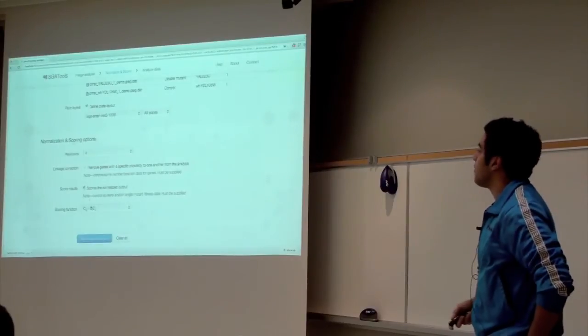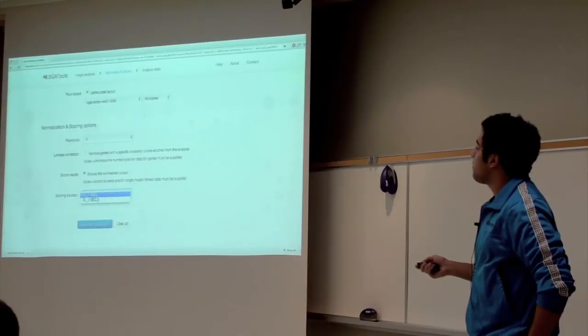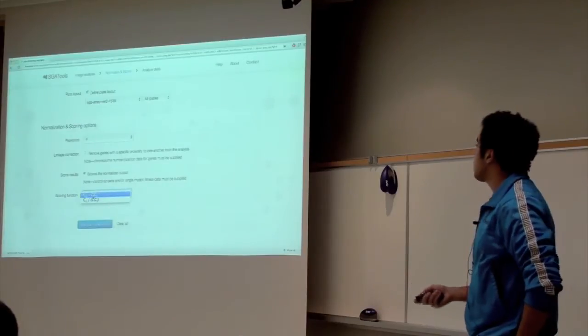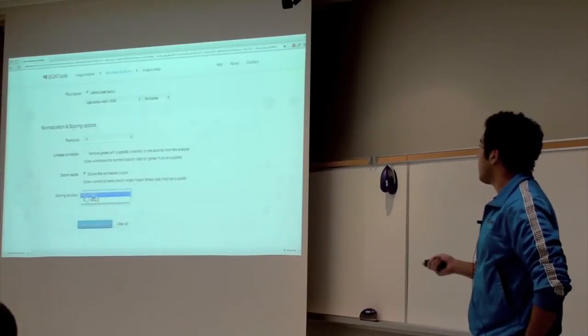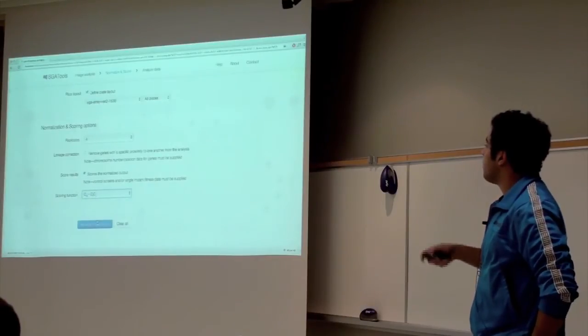So we're just going to go ahead and select all plates. You can select the number of replicates that you have. Typically, the plates are made in quadruples. So like every four is the same replicate. You can select that or you can select one. There's this linkage correction effect, which I can talk about more in detail later on. And you can choose whether you want to score your results or not.